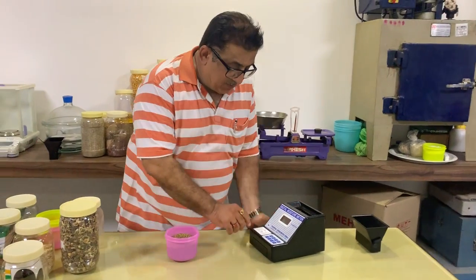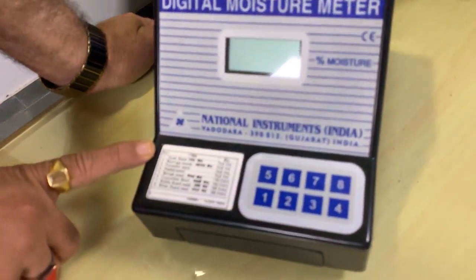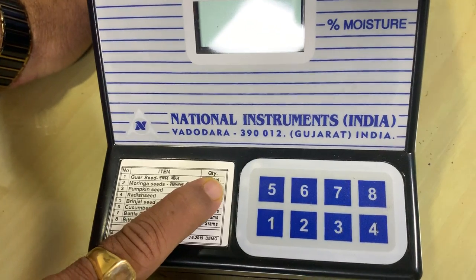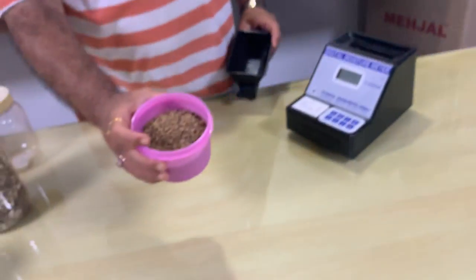We have this moisture meter which is already calibrated for the Guar seed. You can see channel number one is calibrated for the Guar seed. We need to take a full volume sample, and we have the Guar seed ready as you can see.